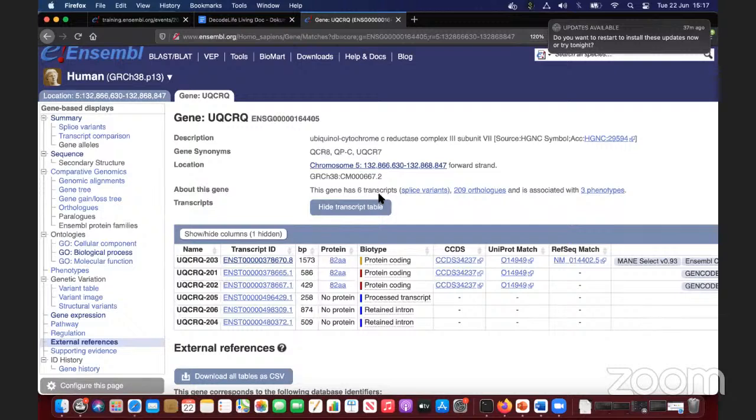And someone asked why transcript ID instead of a gene ID. I believe you're referring to the gene ontology terms. It's because gene ontologies are assigned to transcripts. So for example, you can see those two transcripts here are very different. One of them codes for a long protein, while the other one is not very functional and is non-coding. So they're going to have a very different function. That's why gene ontology terms are assigned on a per transcript or a per translation basis.